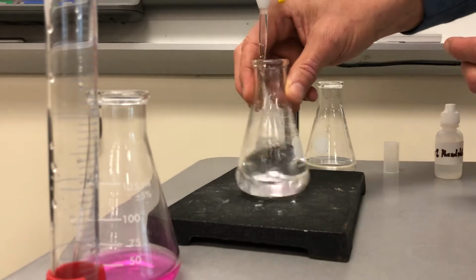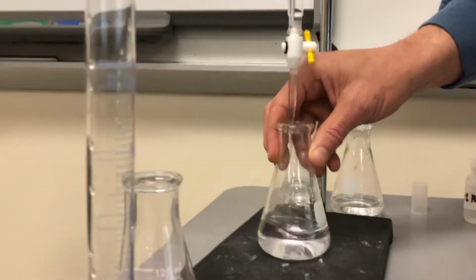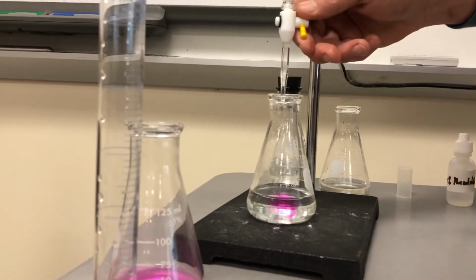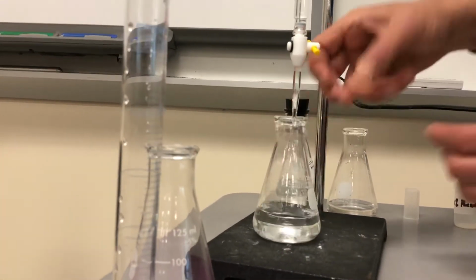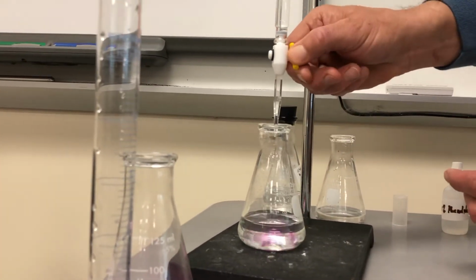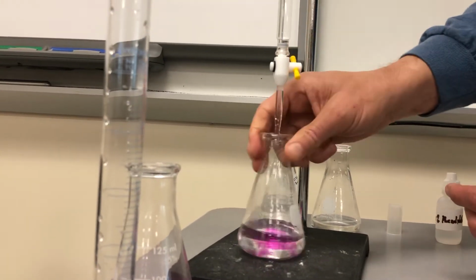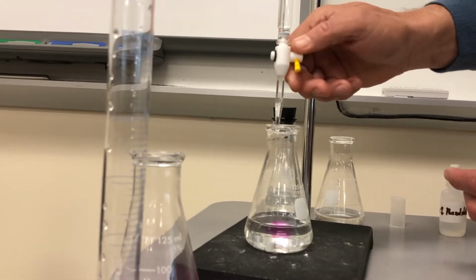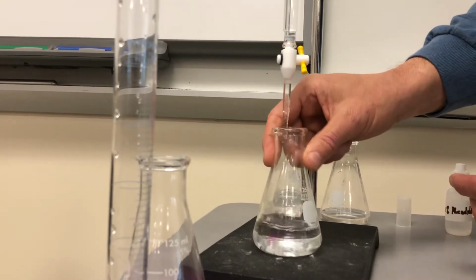Now I'm stirring it ever so gently so that my color will end up holding. Now right in there. It's going away, so I'm going to keep going. Alright, so I'm getting a little bit closer. So I'm going to slow it down to drop by drop.